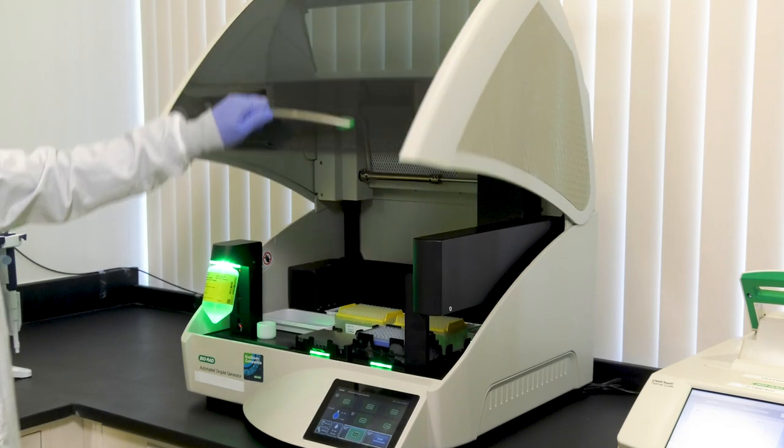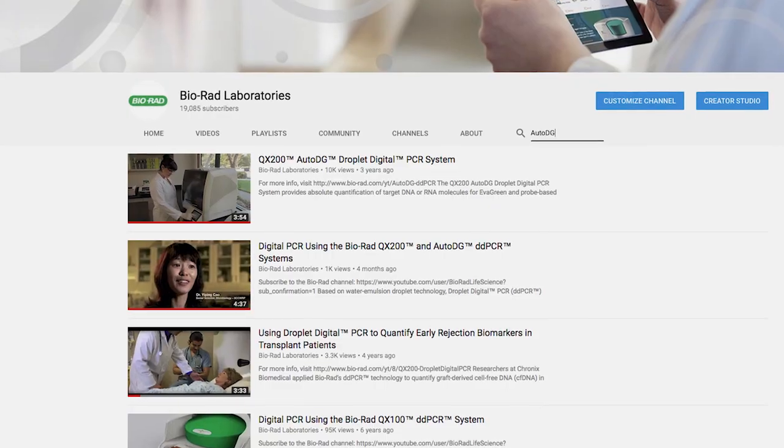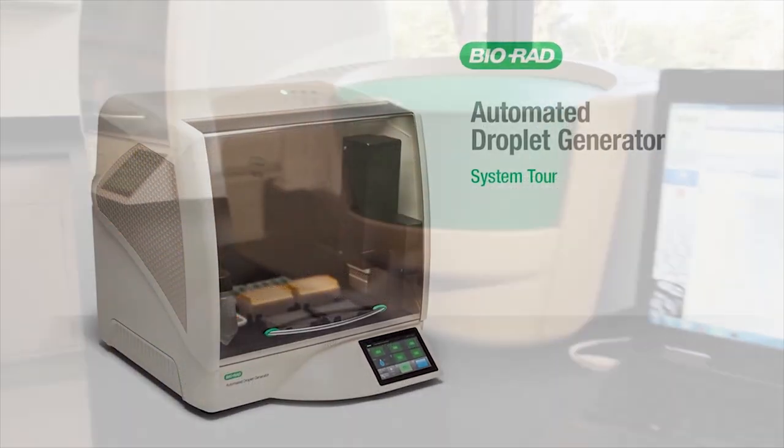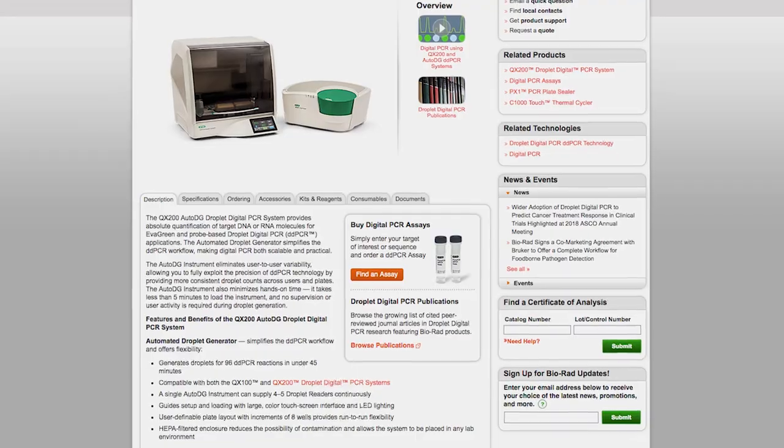Now you can proceed to run the automated droplet generator instrument with the appropriate consumables. Please refer to additional videos on the Bio-Rad YouTube channel and instruction manuals available on Bio-Rad.com to properly run the Bio-Rad automated droplet generator instrument.